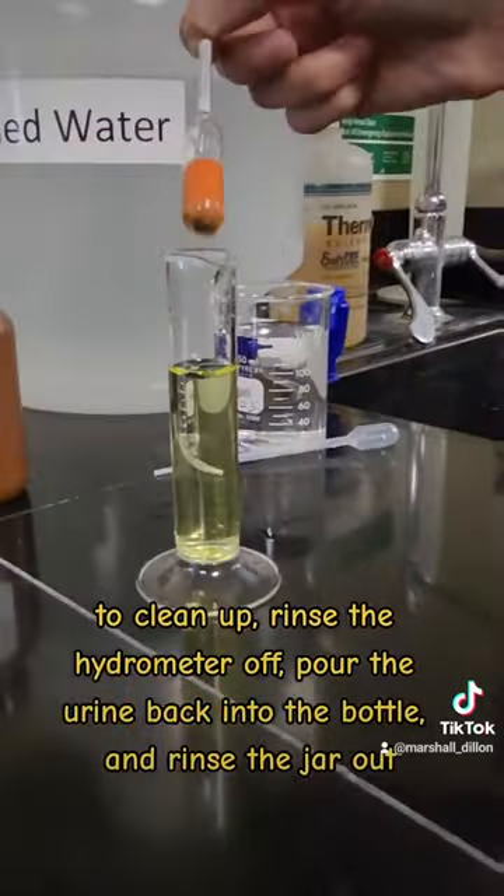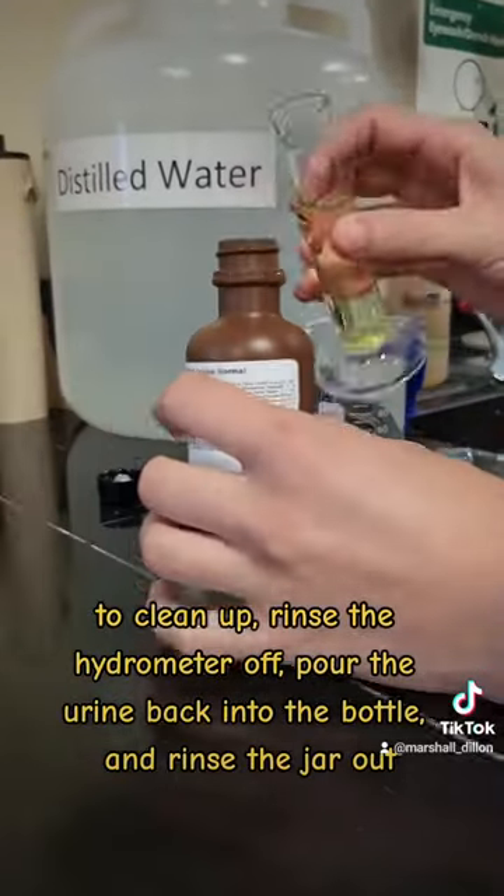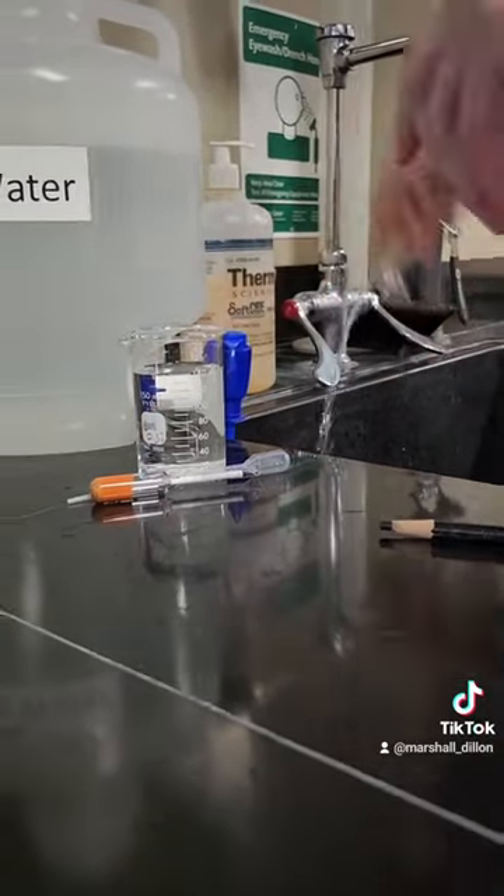To clean up, rinse the hydrometer off. Pour the urine back into the bottle and rinse the jar out.